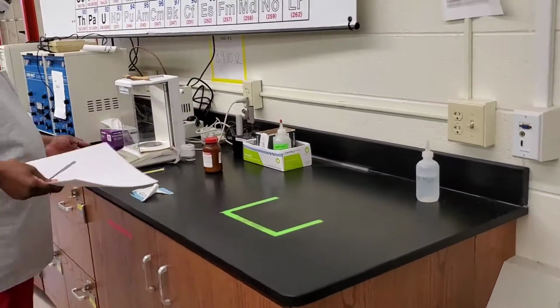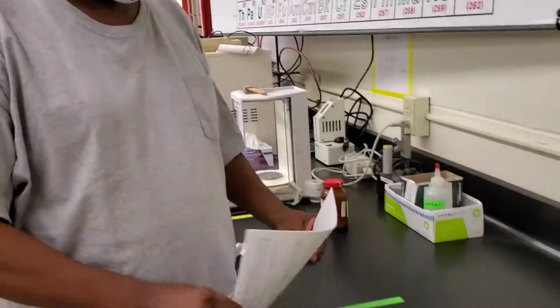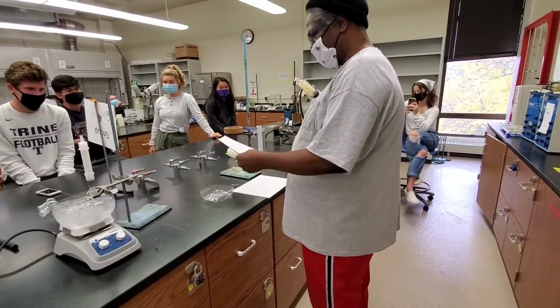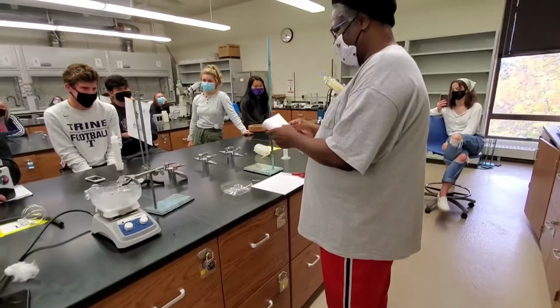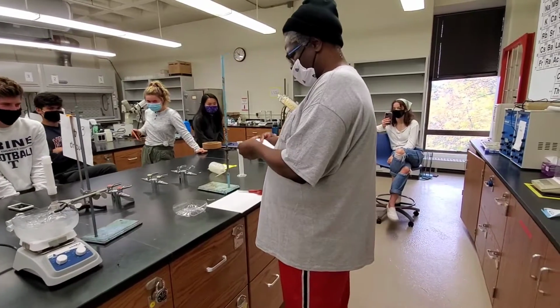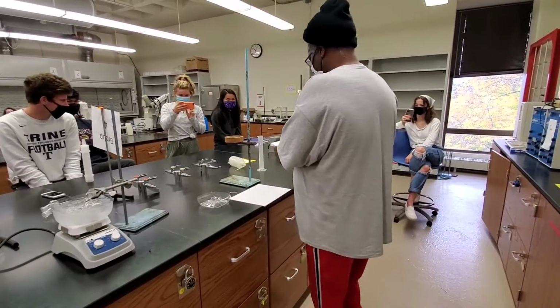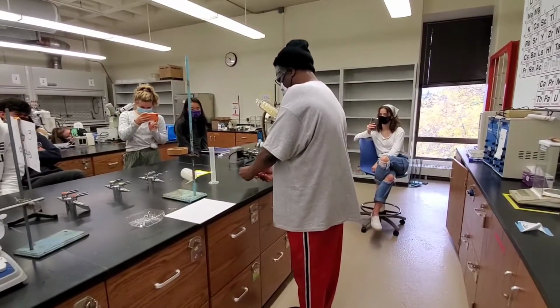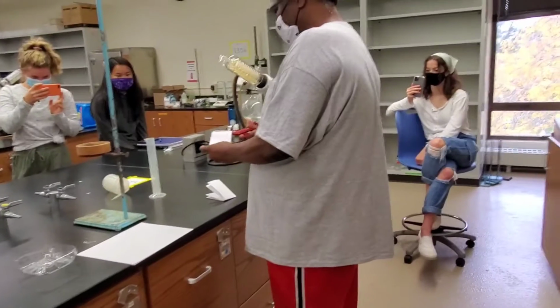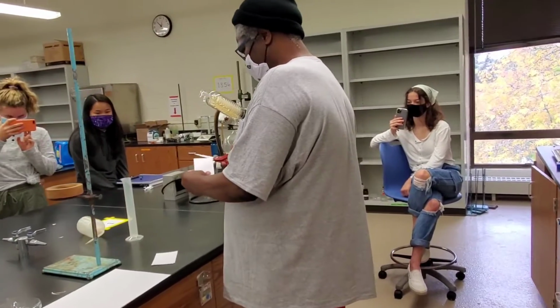Oftentimes you may not see weighing paper. If you don't have weighing paper, don't get all flustered. All you have to do, we have sheets of paper, lots of them that are considered scrap, is you get them, and you could probably make 8 pieces of weighing paper with this. So it's not a big deal. Don't come running to me, oh, I don't have any weighing paper. You just need to say, can I get some scrap paper? I'll make my own weighing paper. Okay? This is not a big deal.